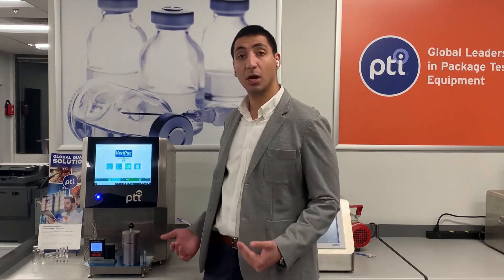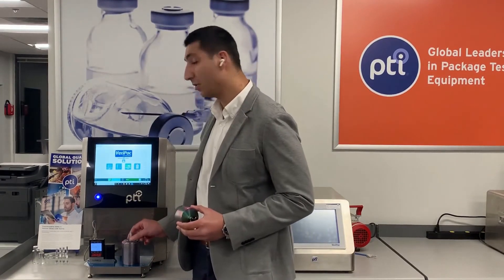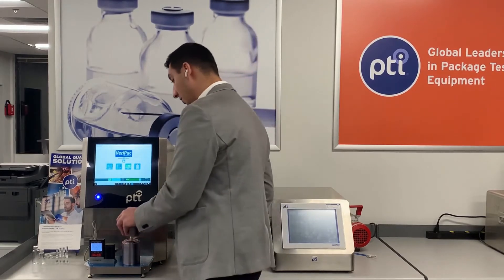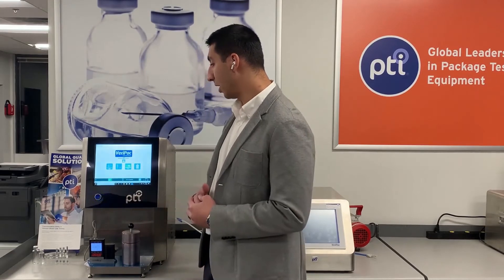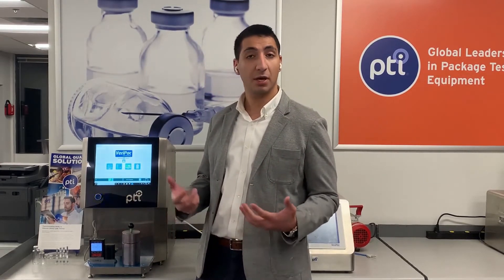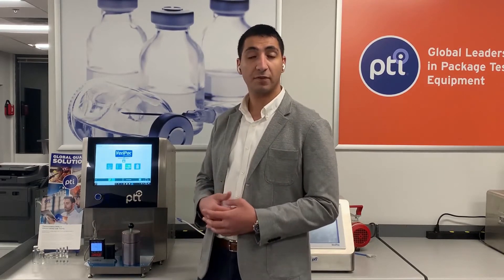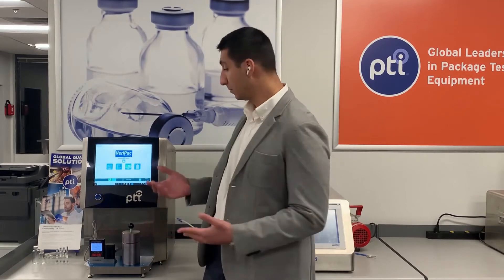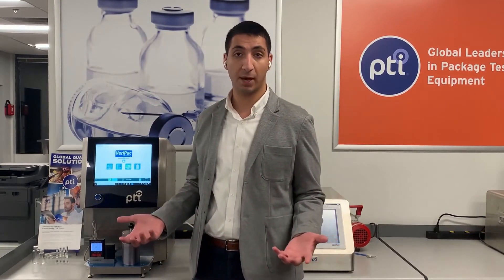In order to operate this system, a sample is placed inside the specifically designed test chamber that's certified to NIST standards. The chamber is closed, and the start button is pressed. Vacuum is then drawn on the inside of the chamber, and the level and change of vacuum over time is monitored. If there's no change in vacuum over time, this indicates a non-defective container — no leaks in that package.